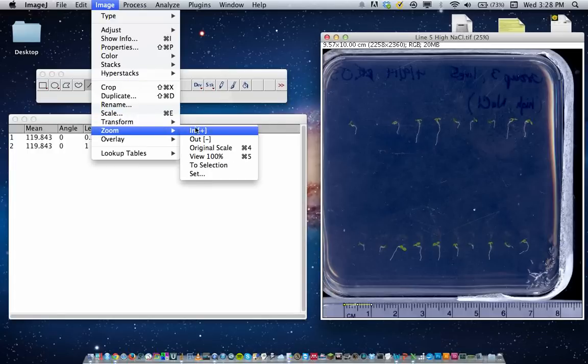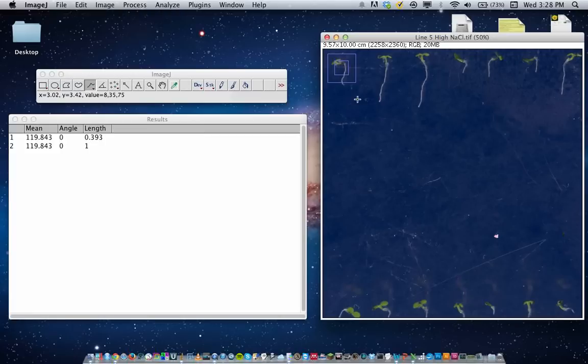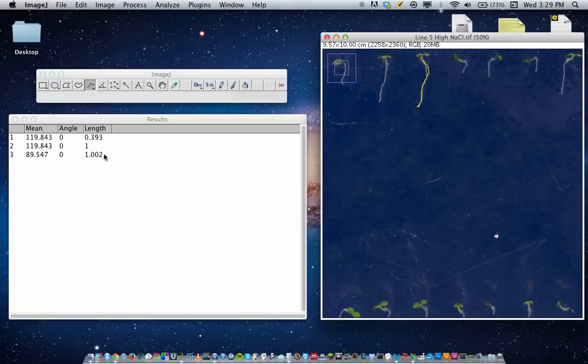So if I want to measure the length of this root, or pretend it's a hypocotyl, just click and drag the line over the length of the root, hit Command or Control M, and that'll give us the length. So that's for one root. There's another root, Command M, and so on. Easy.